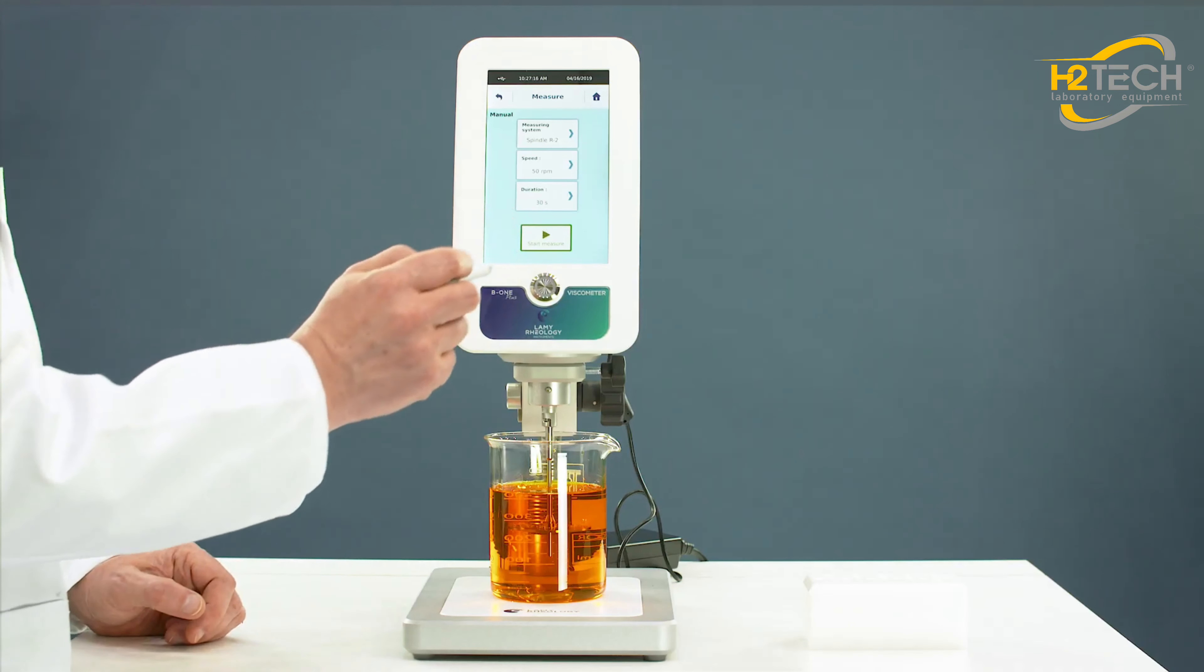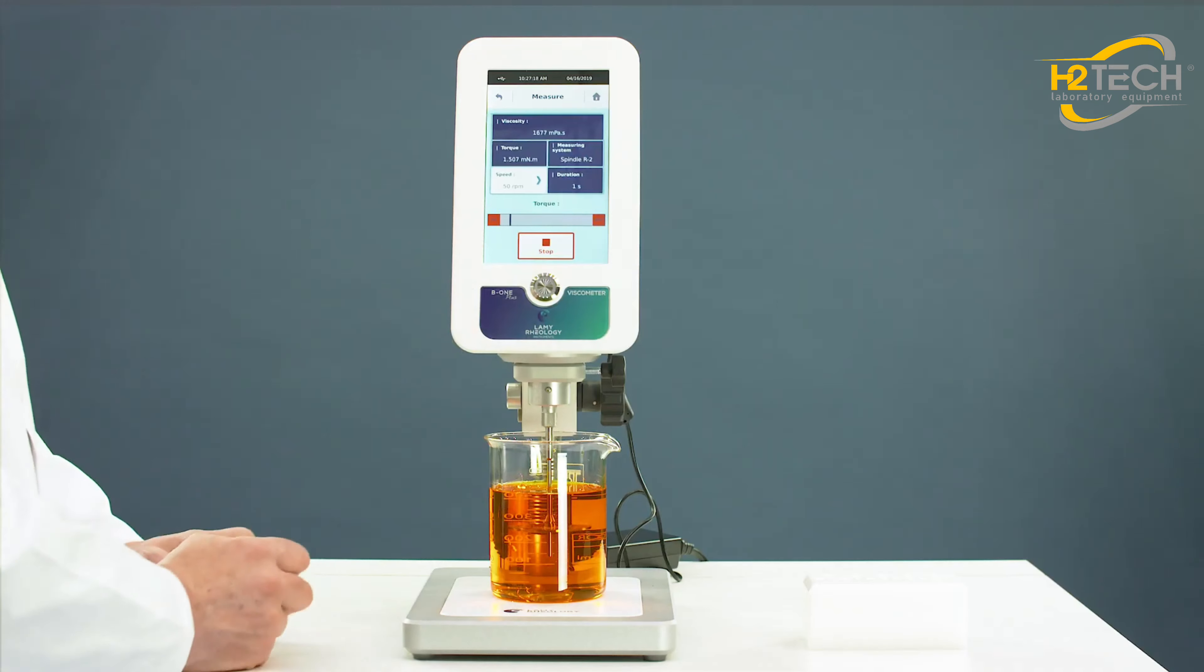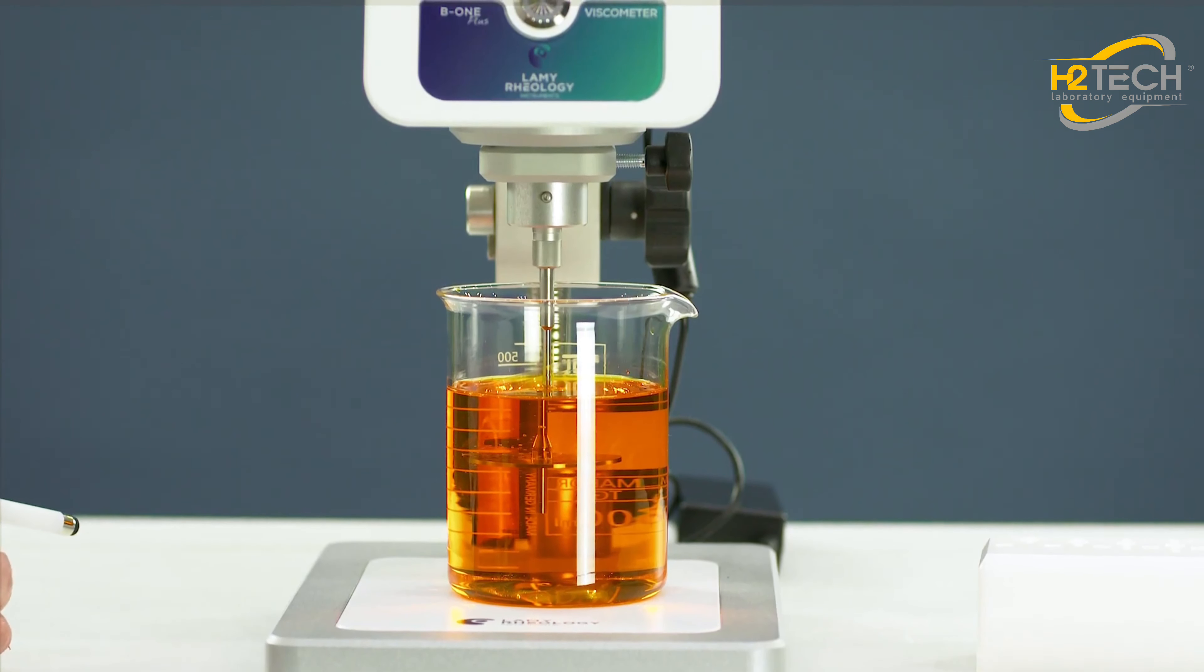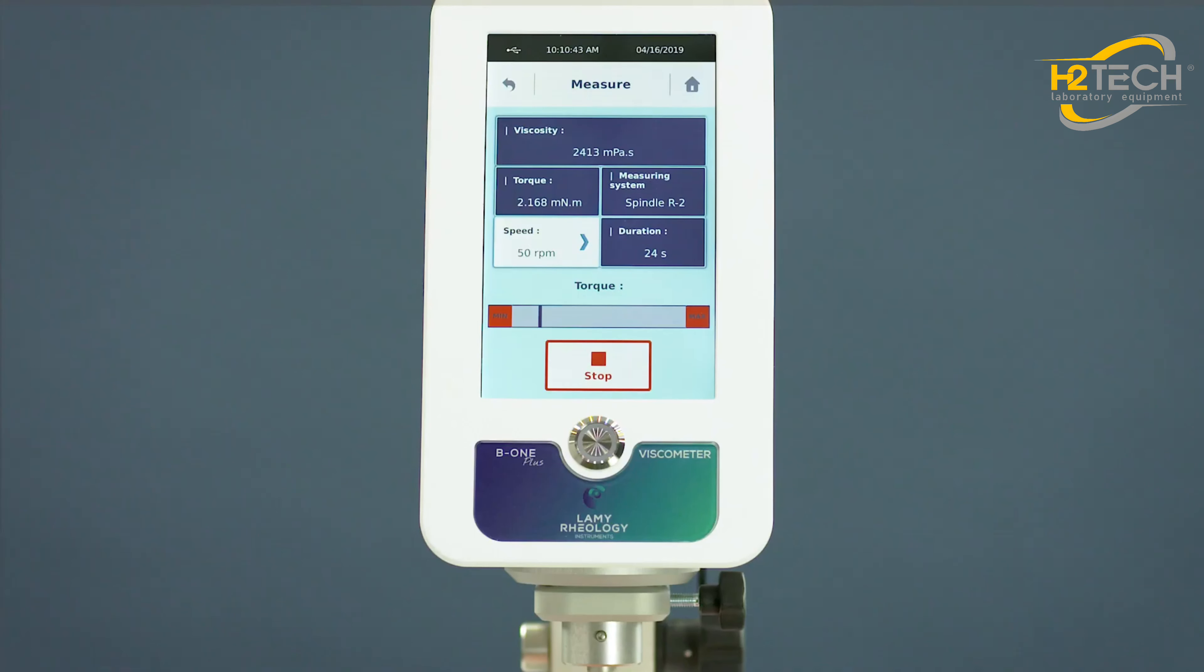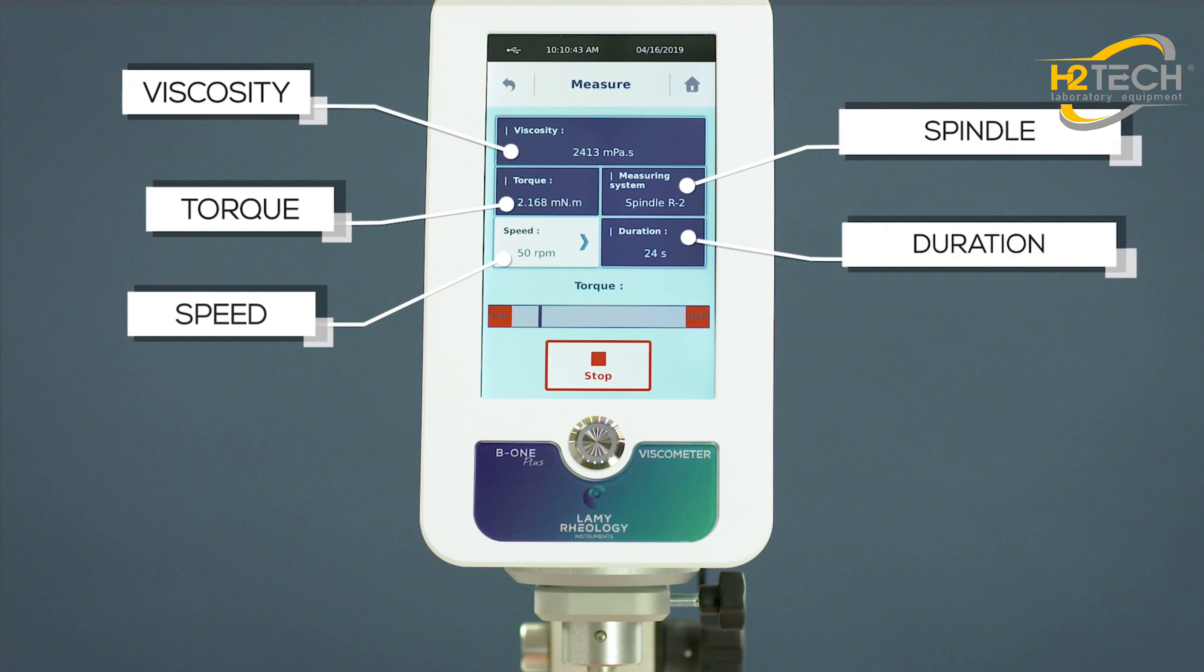Start your measurement. While measuring, the device shows you all information as viscosity, torque, speed, spindle or duration.